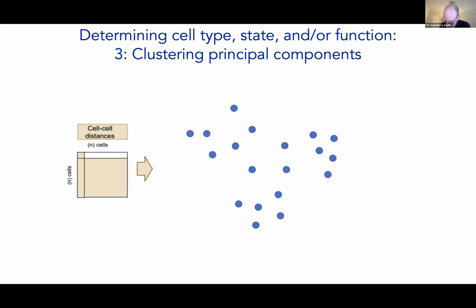Okay, so what we actually do is we take our cells and calculate all pairwise distances. So some cells are going to be close to one another in Euclidean space, some are going to be far apart, and the intuition is that cells that are close together are more likely to be from the same biological cell subset. Okay. So first, we're going to make a graph that connects cells that are close by and keeps cells that are far apart.